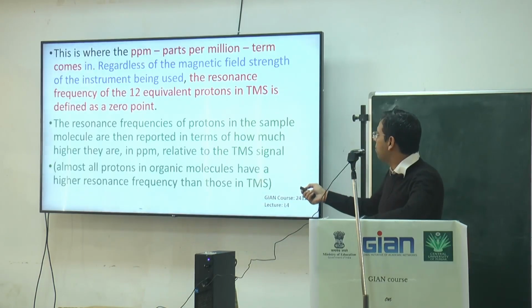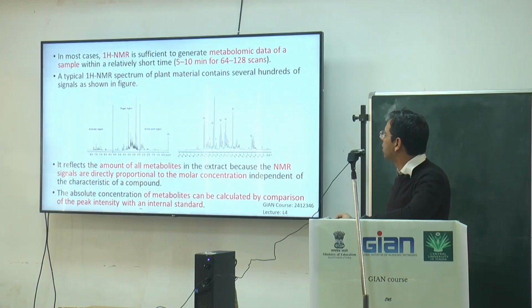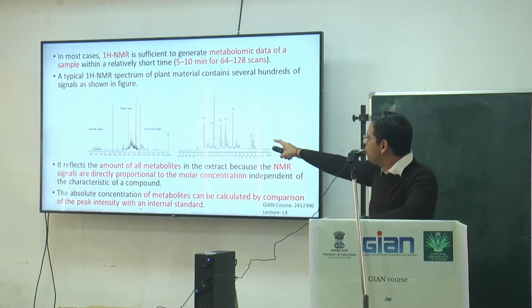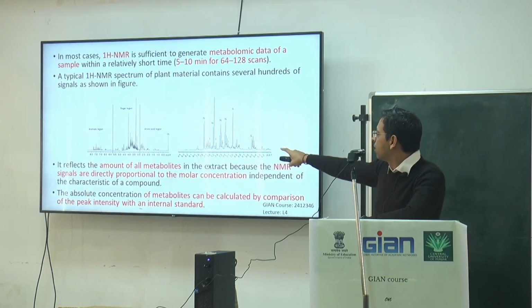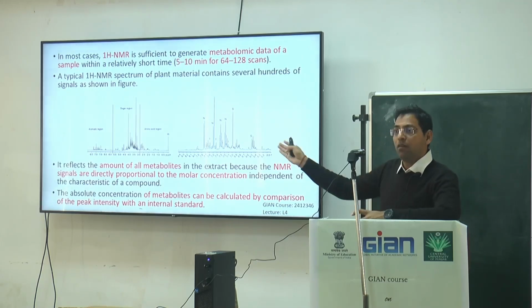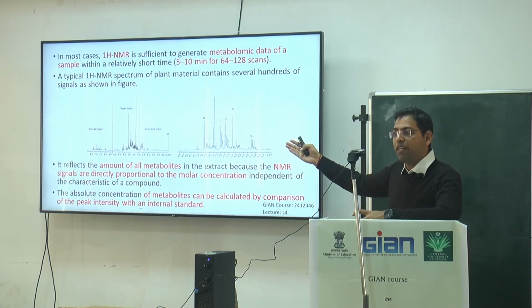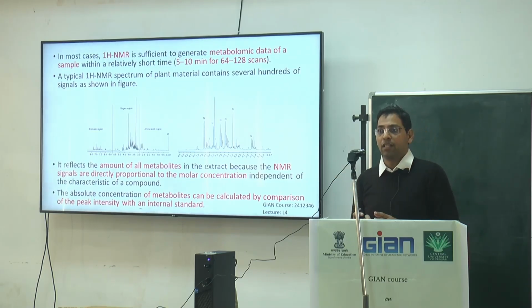Now I'm going back a little bit so that you know about carbohydrates and proteins. The amino acid region is near 0 ppm. Then sugars are more complex; they show resonance at a much higher position. And then the aromatic region, aromatic meaning secondary metabolites and many other things, requires more energy for resonance. So more powerful resonance means they are far away from 0.